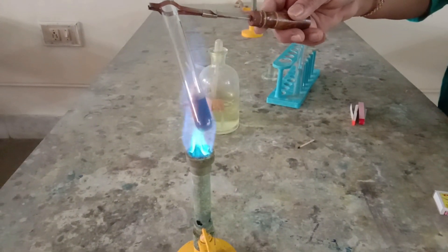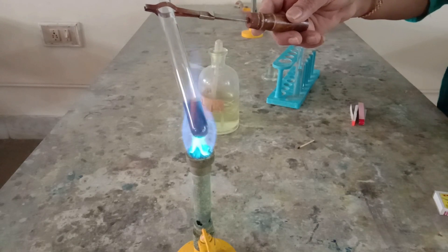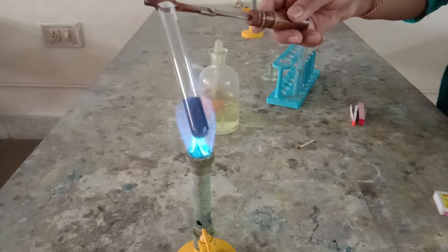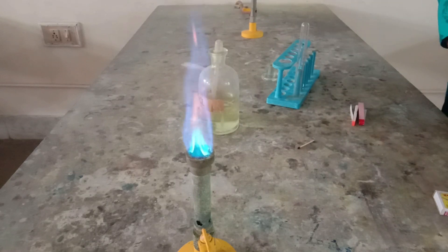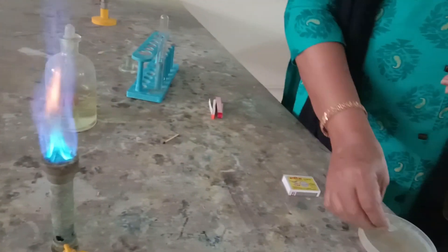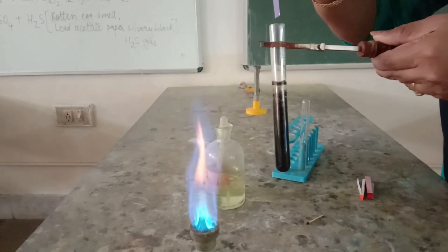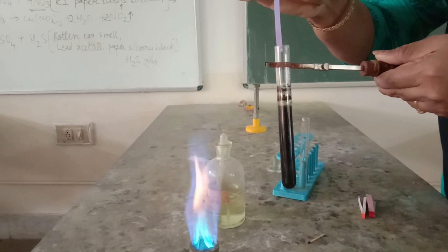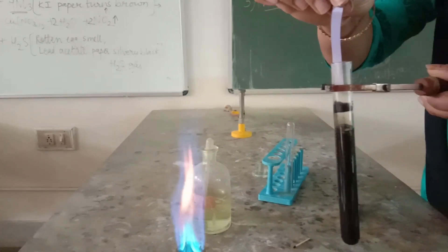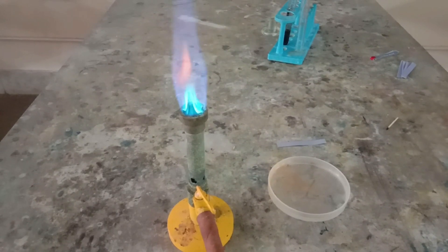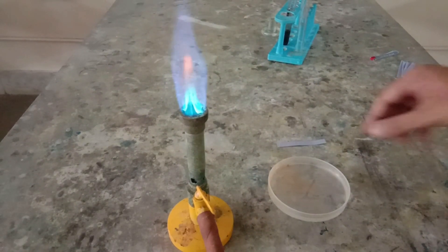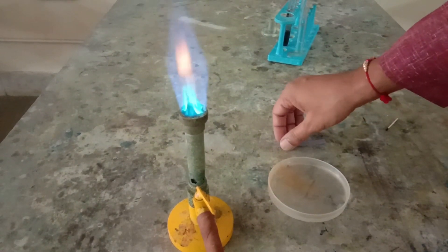The reaction starts. Chlorine gas is a bleaching agent, which means it is going to change the color of the litmus paper. So I'm going to dip a blue litmus paper into the distilled water and gently place the moist blue litmus paper on the top of the test tube. You will see that the blue litmus paper quickly converts to red and finally converts to white in color.